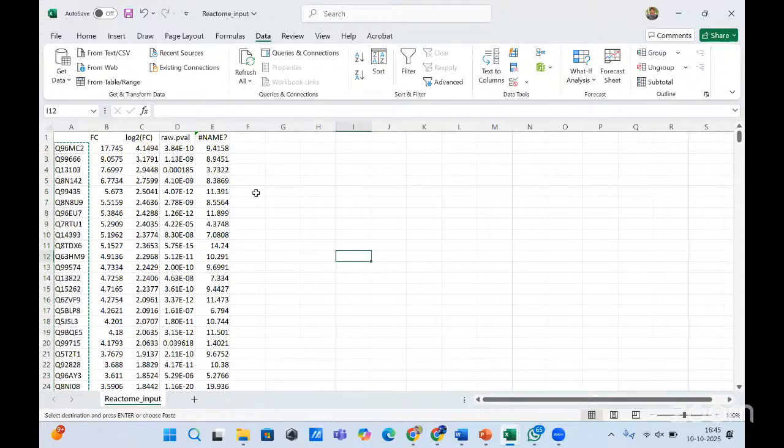So now we are going to show you the next good resource, freely available, Reactome, which is also very good for the visual depictions of the pathways. Amit is going to take a data set from the mass spec, plot it, and show you in Reactome.